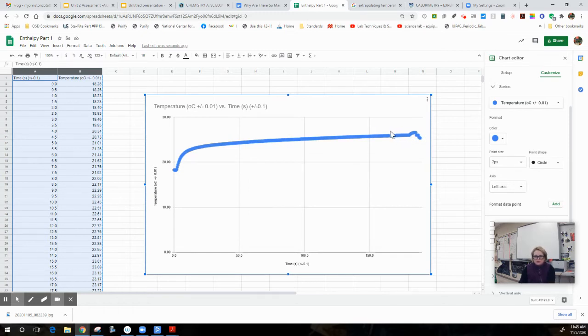And that's because due to time constraints and people calling me during Zoom, because I am multitasking, I took the lid off the calorimeter. So, error. What we're going to do is figure out the true final temperature by using the maximum value here and the minimum value here. And I will show you how to do that in a moment.